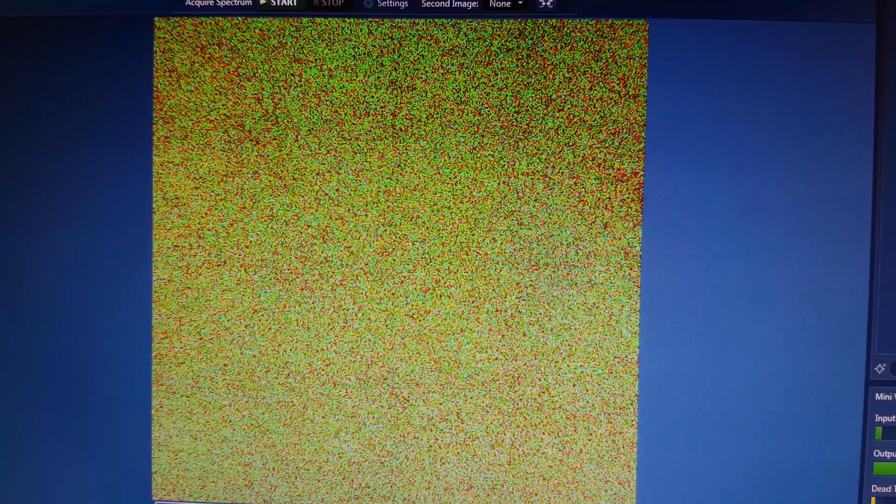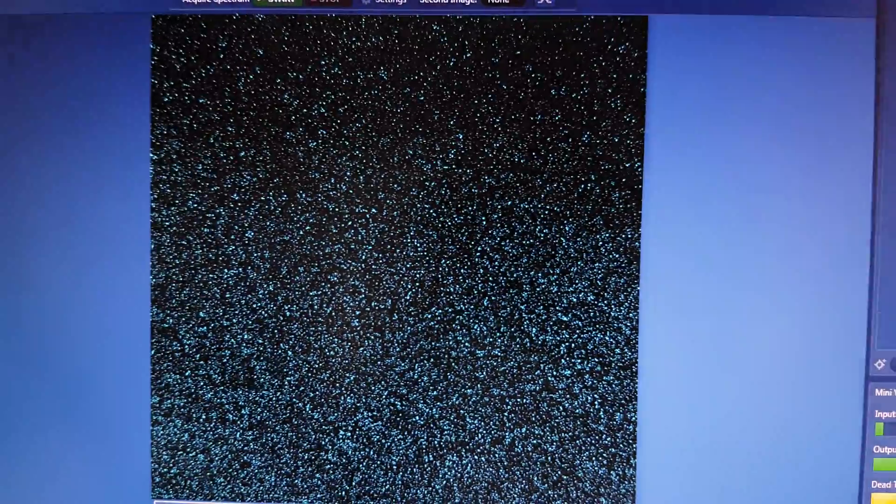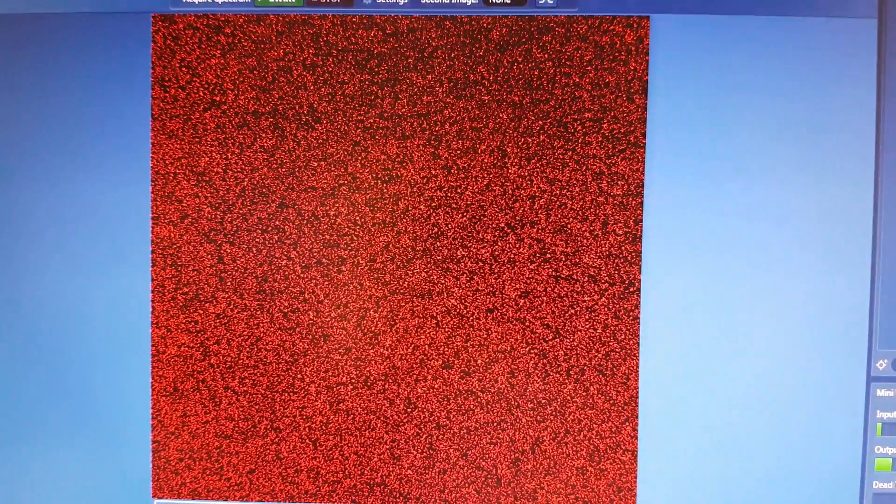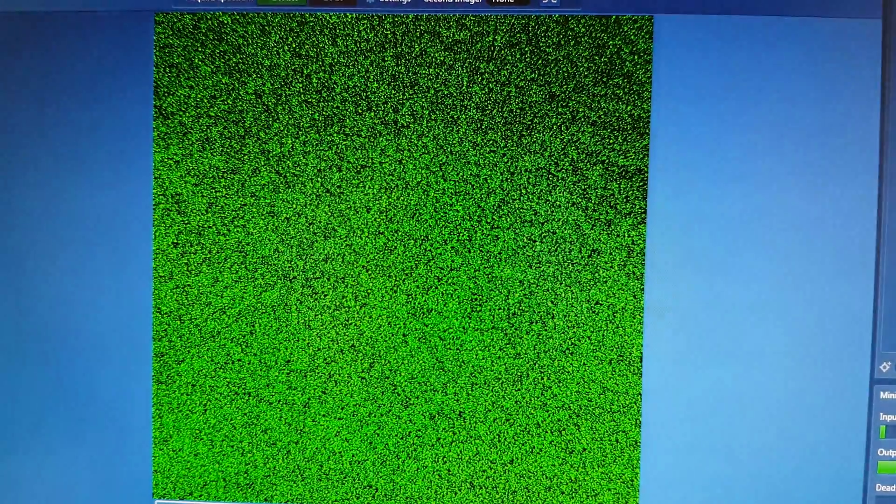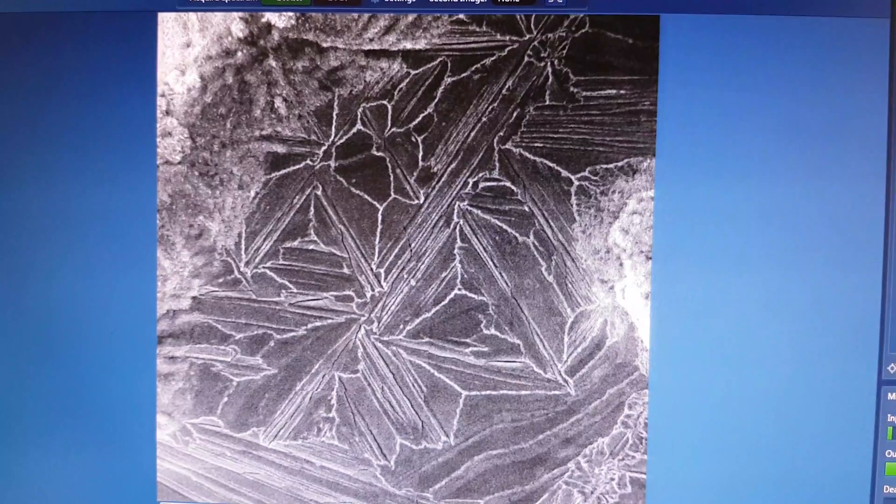And you can't see any differentiation between those carbon, iron, oxygen spectrum.